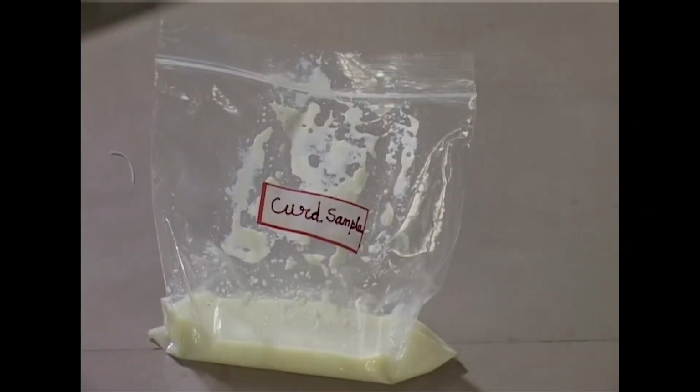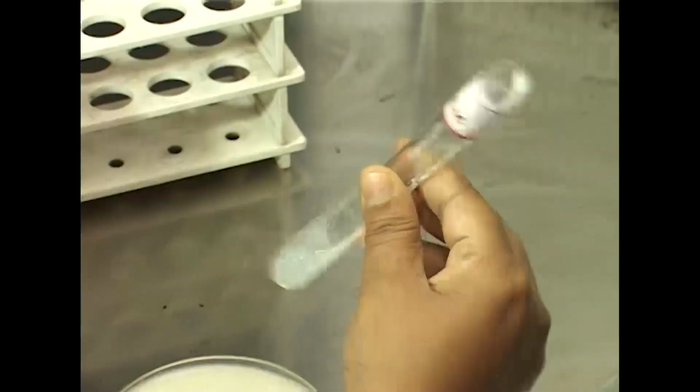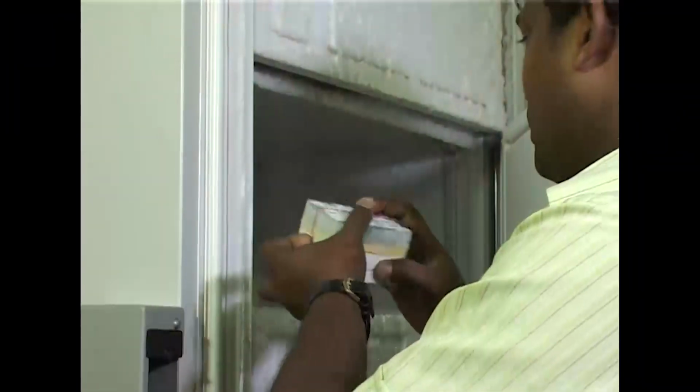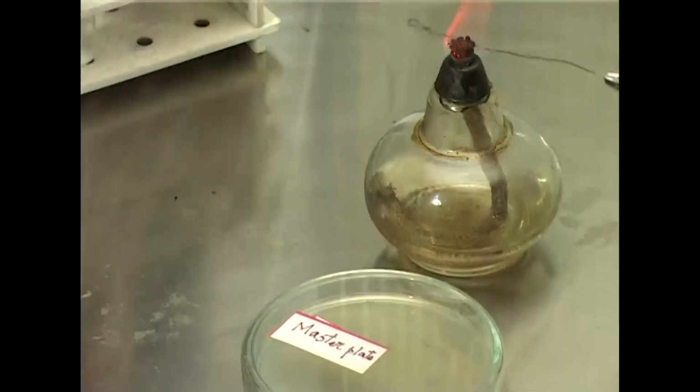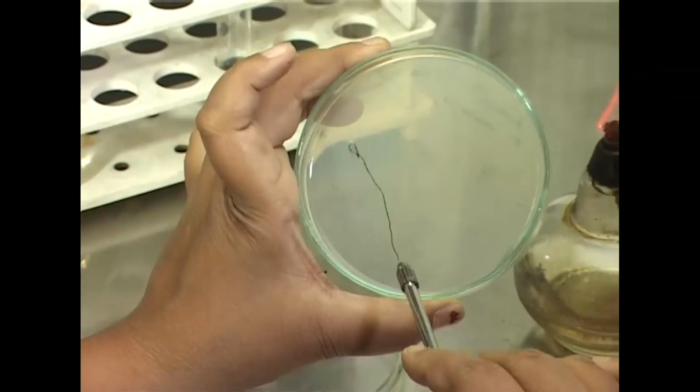First, the collection of sample. The sample is collected from a vendor in very aseptic condition to avoid degradation as well as cross-contamination. Next, sample preparation. The curd is mixed with saline water and it will be stored at minus 80 degrees centigrade by mixing with glycerol. Now, when it is needed, the curd will be taken for streak plate as well as spread plate method to get the pure colonies.